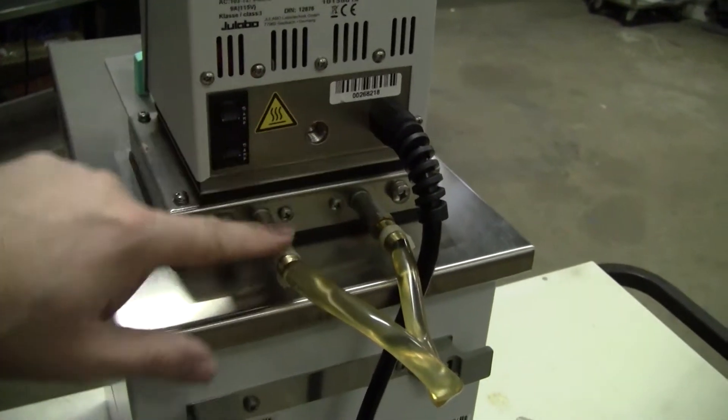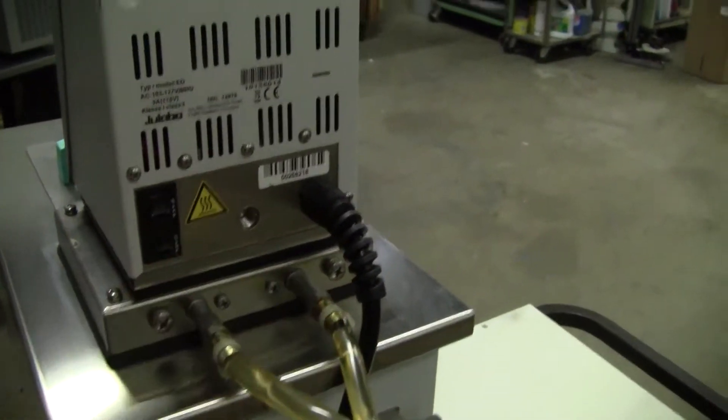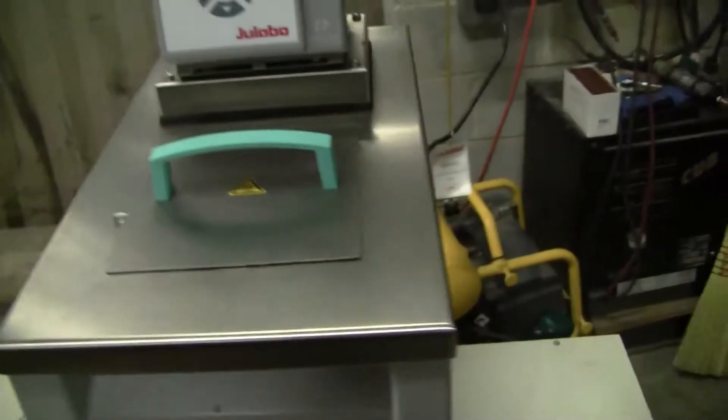The connections are not available through us. You're going to have to call Julabo for the fittings, the tygon tubing. This unit is, I would say, almost in brand new condition.